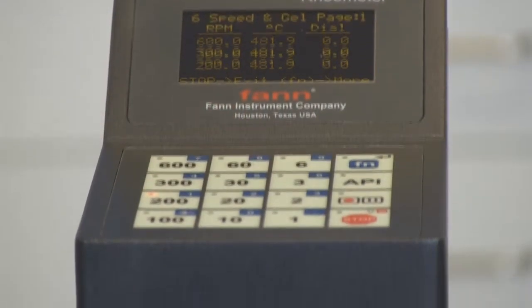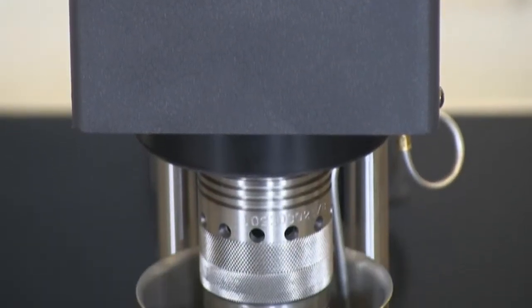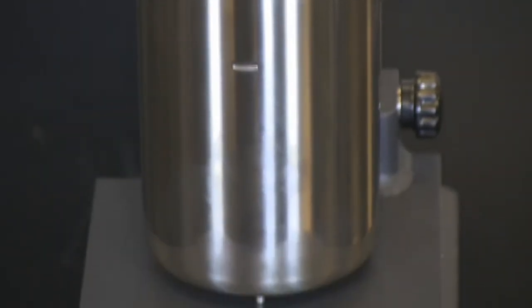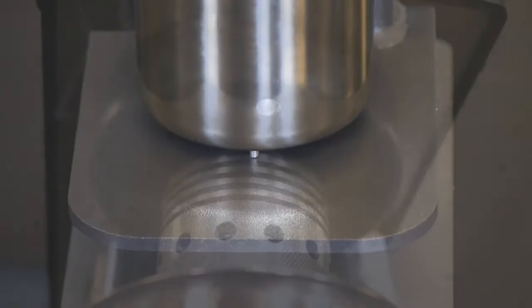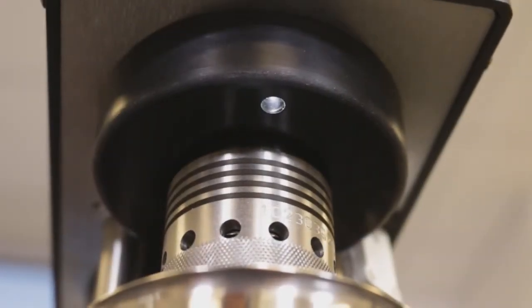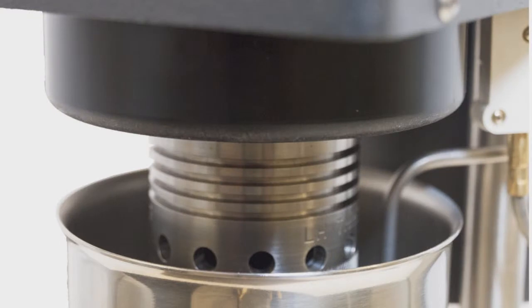We talked with other people who use rheometers before designing the Rheovator Rheometer. And the result: you get an easy-to-use control panel, a secure bob and rotor with a left-hand turn for the rotor, right-hand turn bob for high viscosity fluids, even an LED light to illuminate the sample in the cup. If you have specific project needs, we can custom program your Rheovator Rheometer with your test sequence, allowing you to repeat the test at any time.